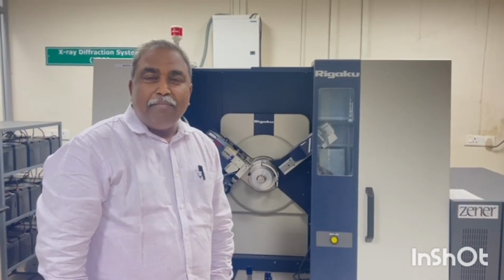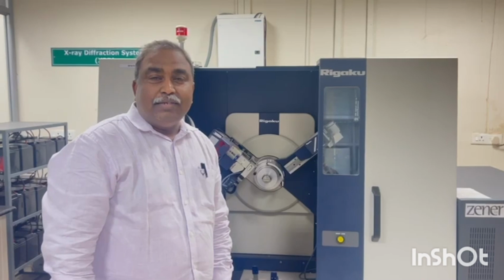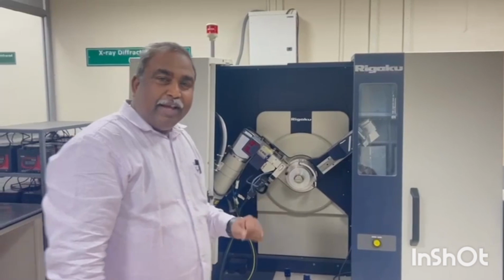XRD works on the principle of Bragg's law, where n lambda equals 2d sin theta, where lambda indicates the monochromatic X-ray that you are using in the system, and the angle of diffraction we measure through the detector. Then based on that we arrive at the D-spacing. Okay, so let us get into the instrumentation part of the XRD.